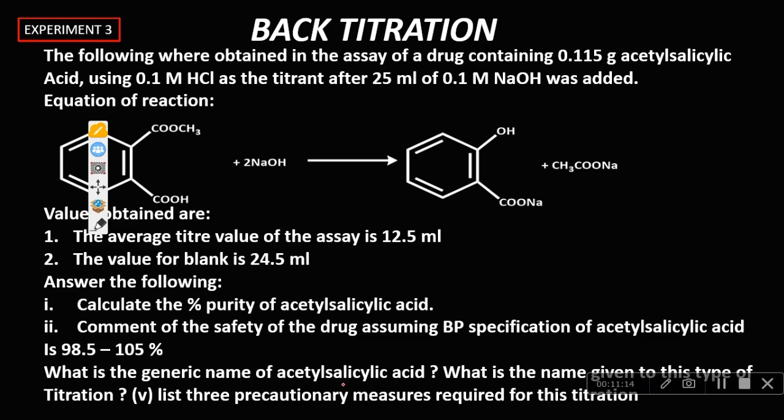What is the generic name of acetylsalicylic acid? I said it before, over and over again. The generic name is aspirin. What is the name given to this type of reaction? This type of titration is called back titration. Are you getting it? As you can see here, back titration.